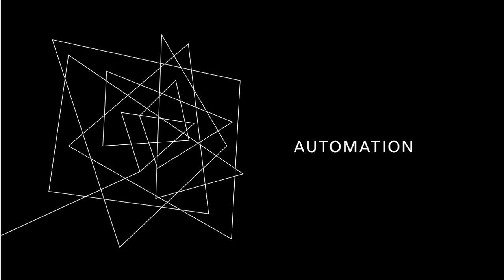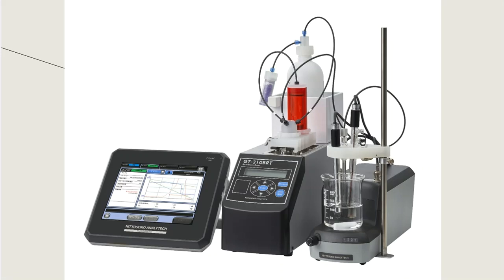Folks, titration's been around forever. It seems like, at least. So this is a common type of test that's done in a lab. So why not bring in an instrument into the lab facility that can automate this process for us and kind of take control? That way, as it's titrating a sample, I can turn my back and do other things in the lab. And then I can come back to this instrument, which is an automated titrator, and just print off the report, see what kind of values or results show up on the computer screen, and call it a day. So it does make my life much easier, at least we hope it makes it much easier.